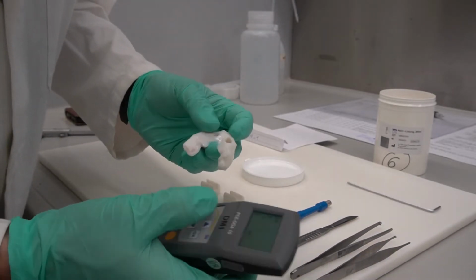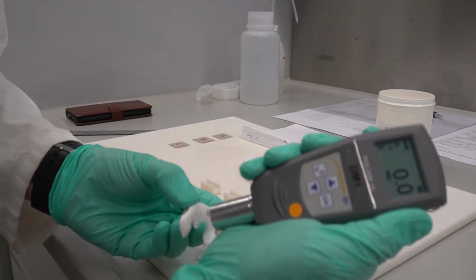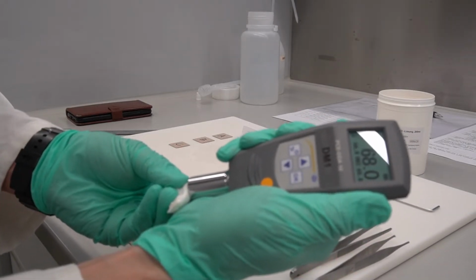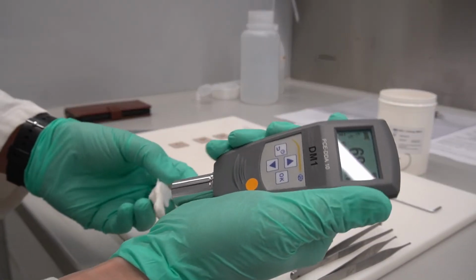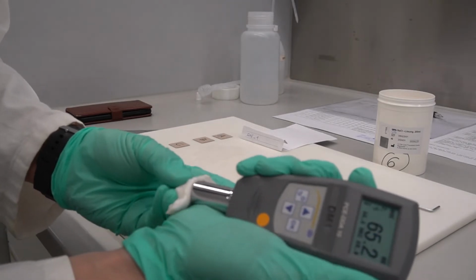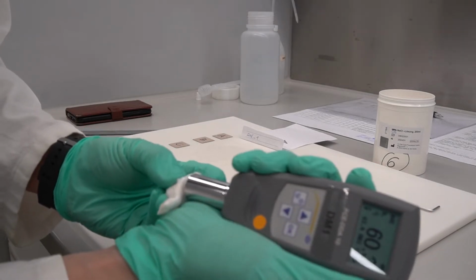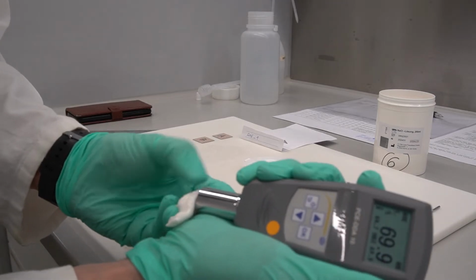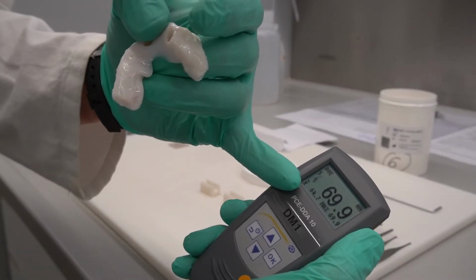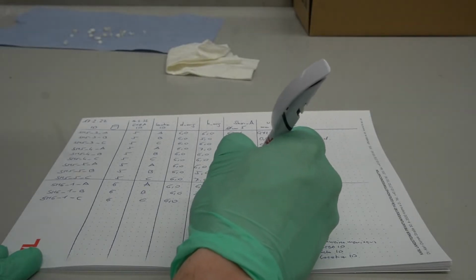So let's turn it on. It reads 0, and then can you see that? Pressing it here against, wait a few seconds. Okay, and you have a value of 68, and I do this 5 times and the device is automatically averaging those values. And it is always around 60 or 55 to 70. I have now measurement 5 of 5, and the average measurement is 64.7 shore hardness.